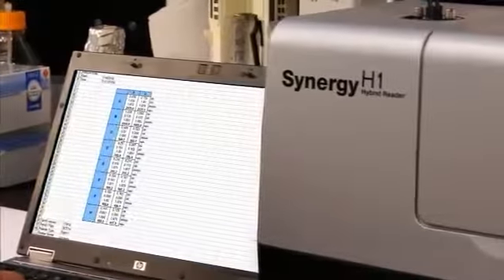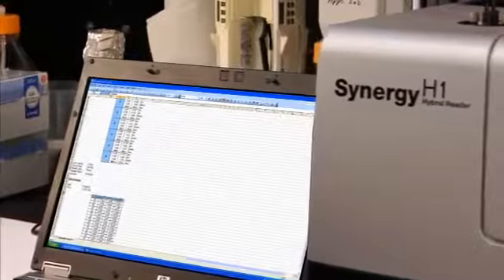Using the Gen5 software, the results are calculated automatically and displayed in an Excel sheet.